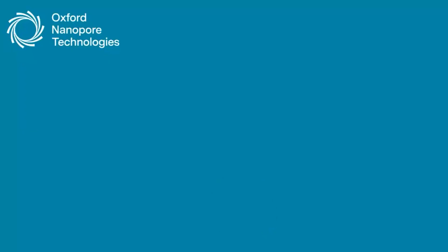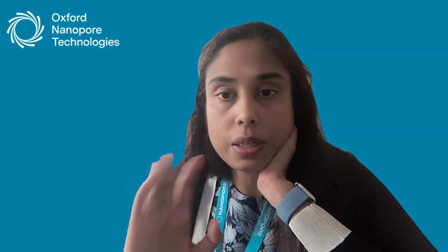So that's what we have in terms of data analysis discussion. And right now, Teddy, Shweta, and anyone who wants to, if you have any particular question related to data analysis, starting from Minknow or Epi2me or any specific workflow, please feel free to ask.